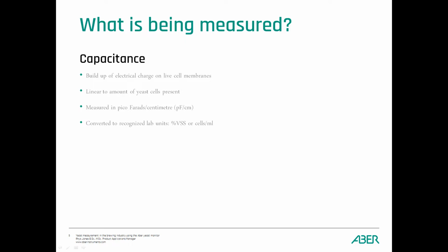And this conversion process is performed during the calibration procedure, which will be discussed later, as well as in training videos and other training material, all of which can be found on the Aber Instruments customer portal. For more information about this, please contact the support team at Aber Instruments, the details of which will be shown at the end of this presentation.